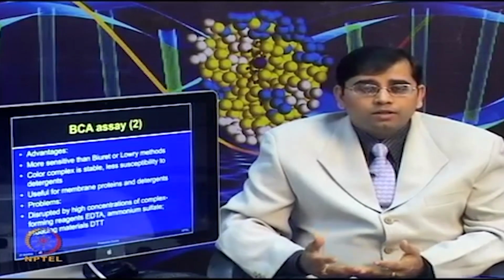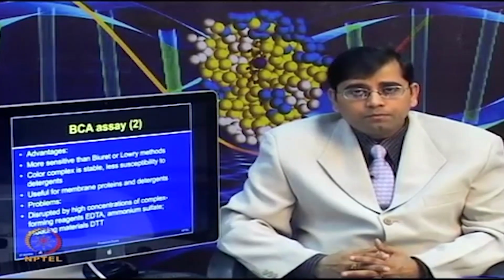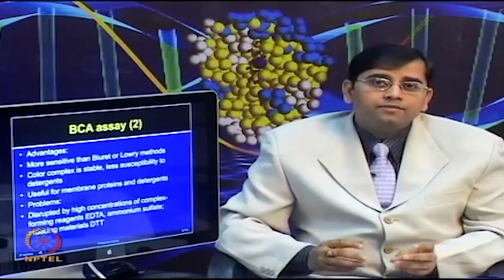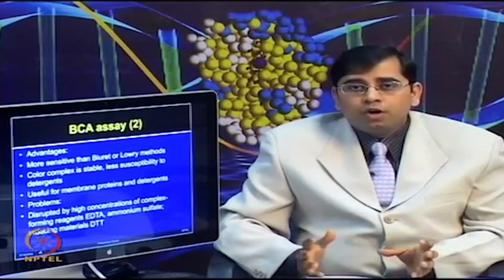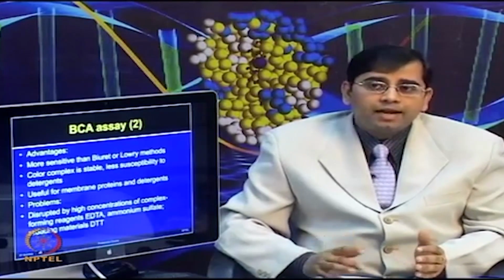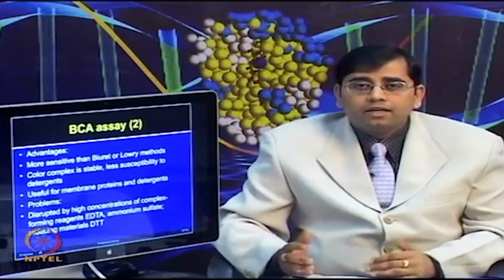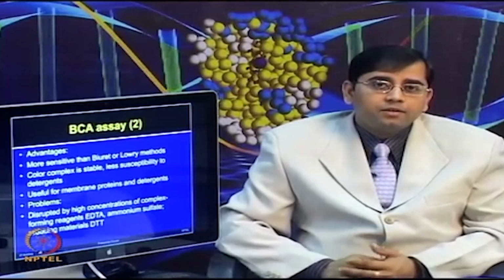In all of those, you are starting with an equal amount of protein, 100 microgram for example, but your quantification has some artifacts, because some components are interfering and giving a false reading. So, your quantification will not be accurate, and rather than measuring 100 microgram from the controls and the treatments, you are actually measuring 90 versus 100 or 100 versus 110. So, there will be artifacts if you do not start with the exact protein amount.